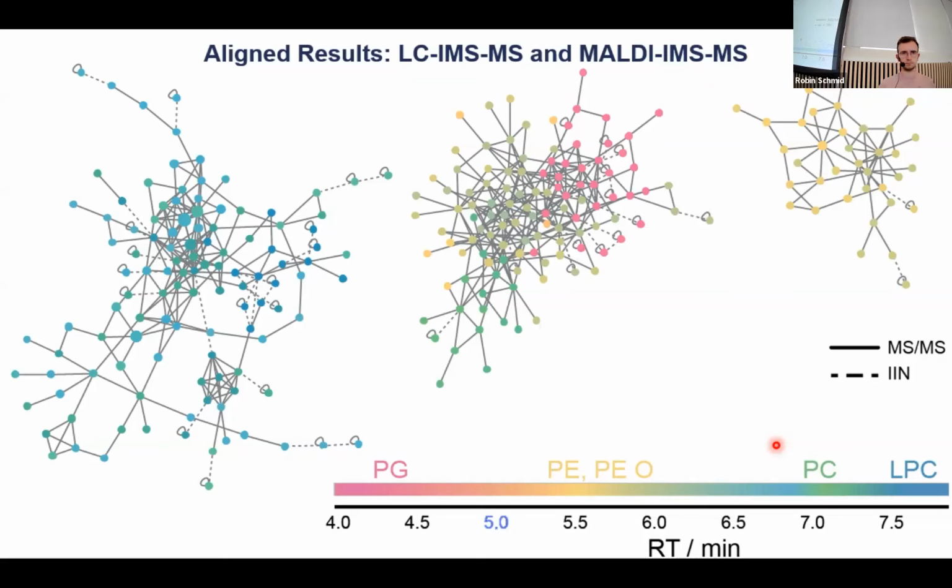That's also why we support the native format, because converting them to mzML really explodes the file size. And I just want to stress that very often, with the QTOFs and the Orbitraps, with higher resolution mass spectrometry, you can already do all this non-target metabolomics. And then for some compound classes, or maybe for validation, TIMS or IMS in general might be very nice to separate more and find some new things.